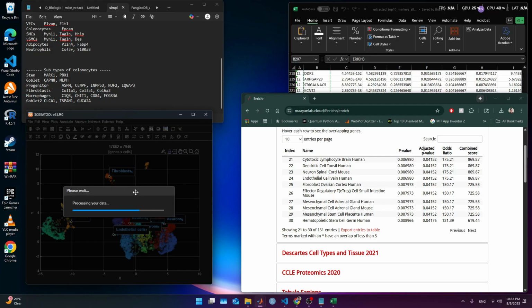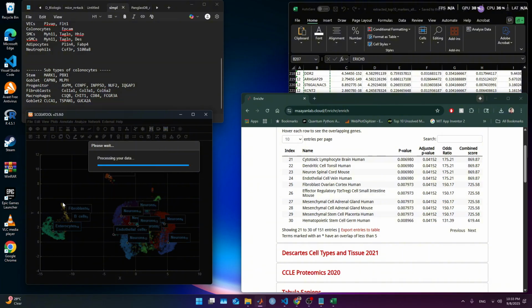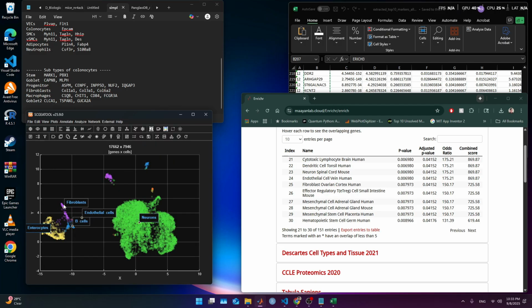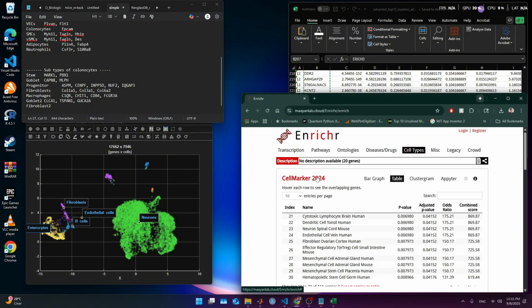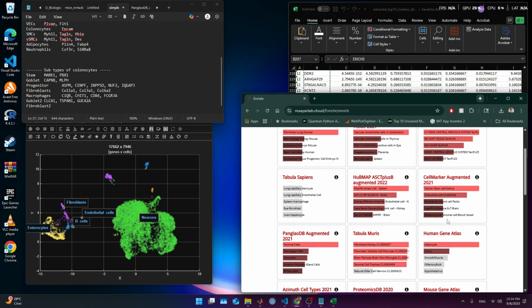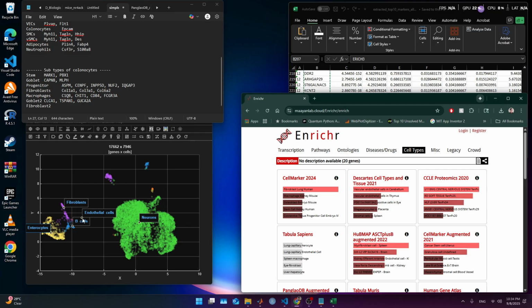But I don't know what type of fibroblast. Right, it's there. It's coming out again. Here. So this is also fibroblast, but it's different fibroblast population. So we can call it fibroblast 2. And in the end, we resolve what it's different within it. So what we can do is repeat, come in here and look for fibroblast. Although it says ovarian, but it was fibroblast somewhere else. Fibroblast. So in theory, that other is also fibroblast, but it's different.